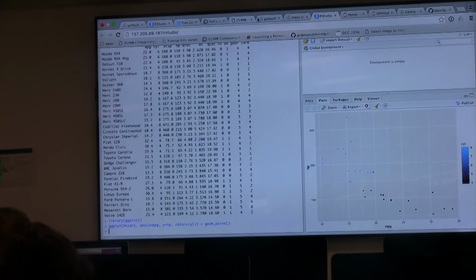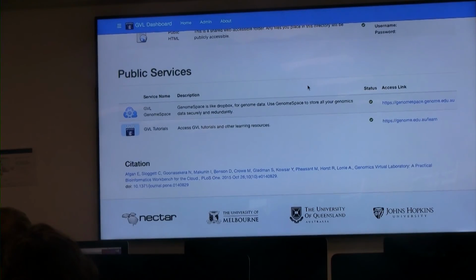If you're interested in trying the nullarbor pipeline, the final part of the pipeline is it actually generates an HTML report which breaks down all of the results. This is actually the nullarbor output you get if you do the nullarbor tutorial.